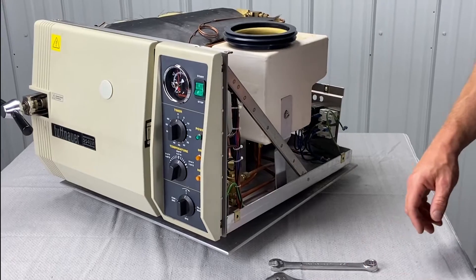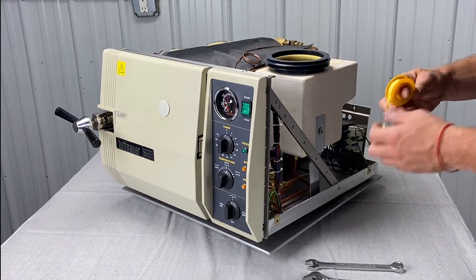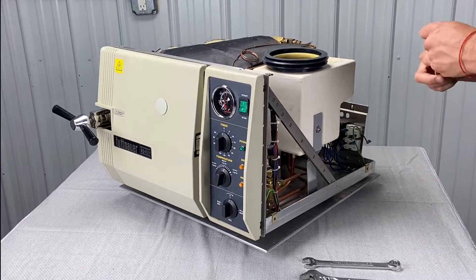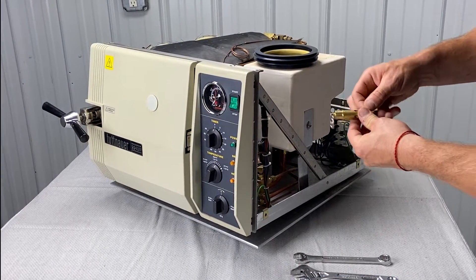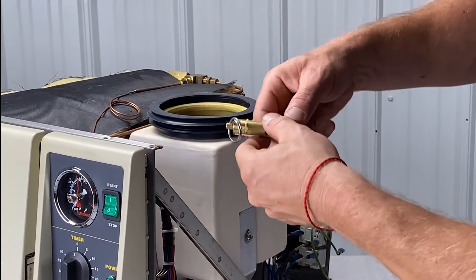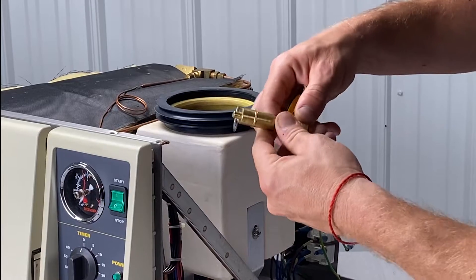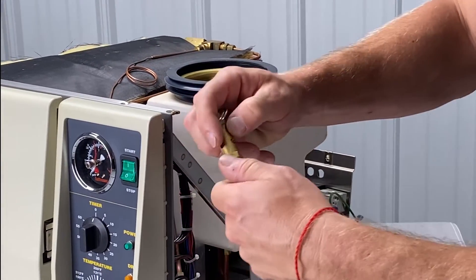We're going to replace the safety valve. It's recommended you have some Teflon tape. I like to use the yellow stuff — it's for gas lines, but it's a lot more durable and lasts longer. When you're applying it, go clockwise, and you don't want to have a lot of excess dangling.